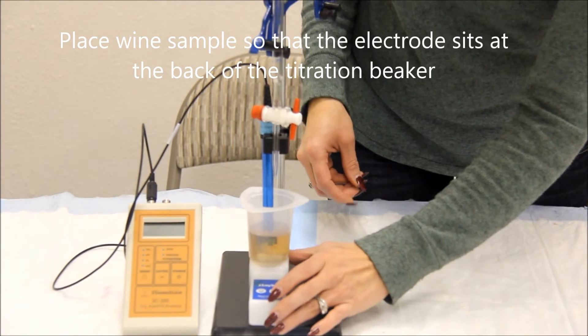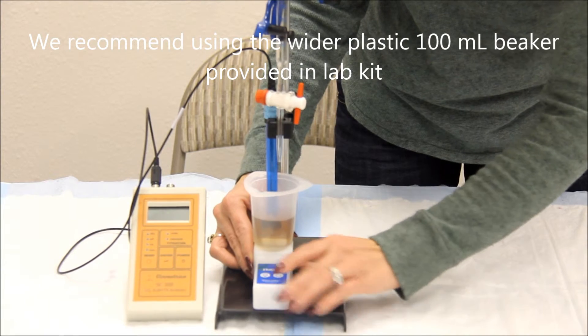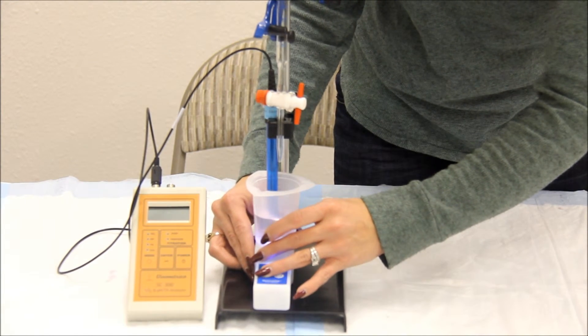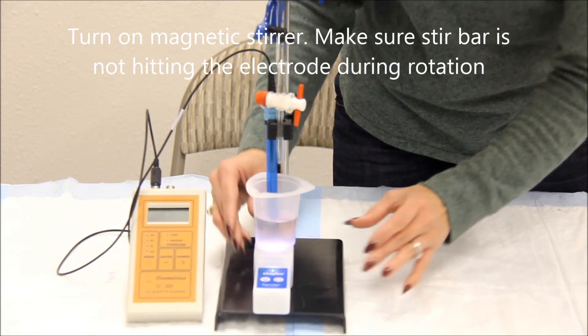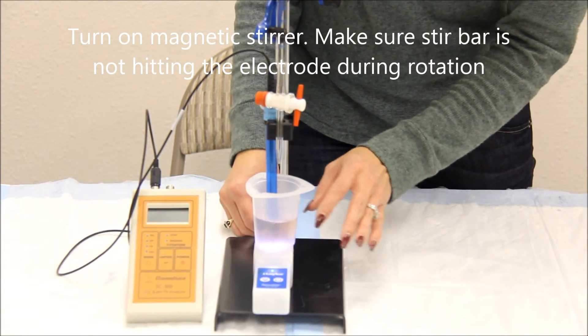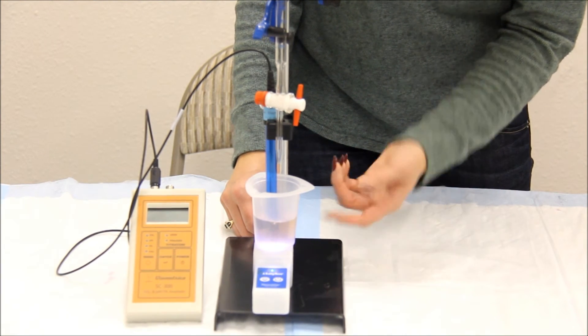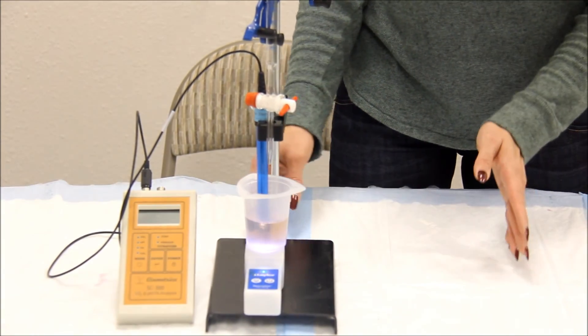You can turn your magnetic stirrer on by either hitting the power button or the light switch. Make sure the magnetic stirrer does not hit the electrode while it is mixing. You are now ready to begin any titration that you may need.